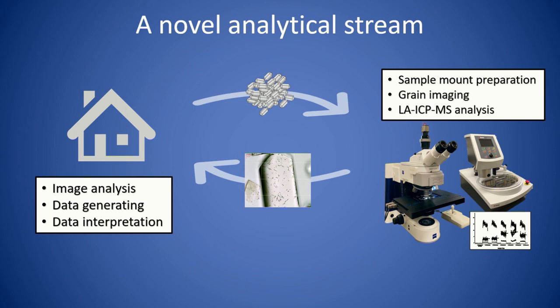Following this proposed training sprint, researchers have the option to outsource sample preparation, image capture, and the laser ICP-MS analysis to laboratories equipped with adequate hardware and software. Samples will be returned in electronic form to the newly trained analyst for digital analysis and data interpretation. The advance of this digital training module could potentially make this method more achievable for geoscientists globally currently without either these capacities or access to laboratory overseas.